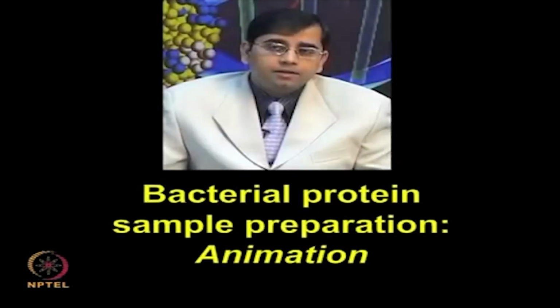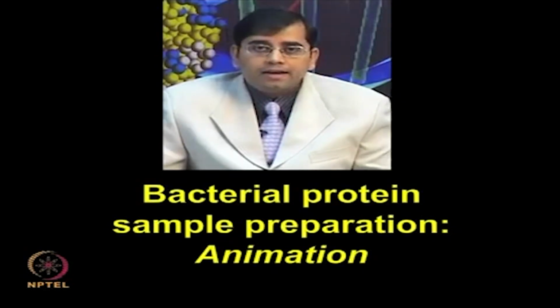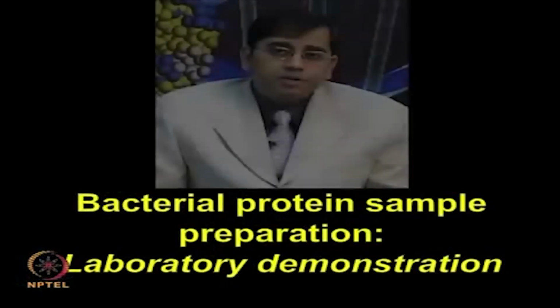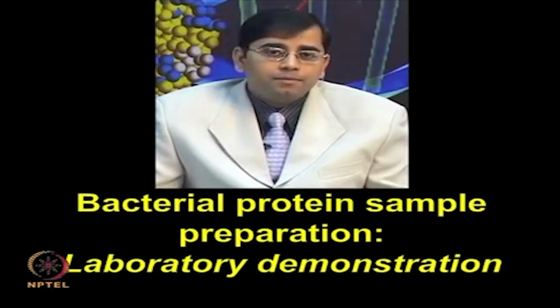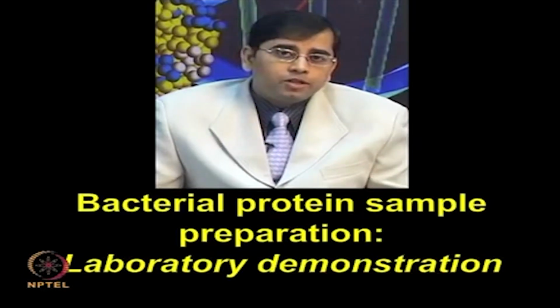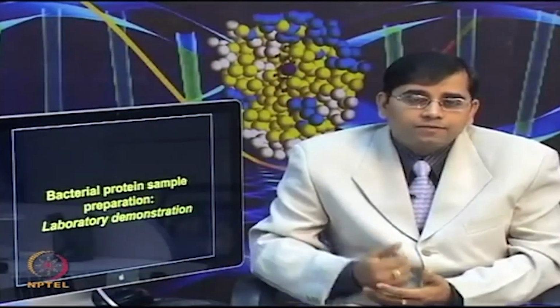This was bacterial protein extraction using the trizol method, and you must appreciate that in this method you can obtain RNA, DNA and protein, all the biomolecules together. So, to give you further information about the detailed protocol as well as how to perform these experiments in the lab, I will show you a video of the laboratory demonstration of bacterial protein sample preparation for proteomics applications. So, let us watch this video.